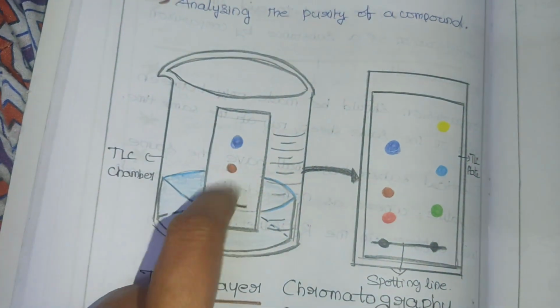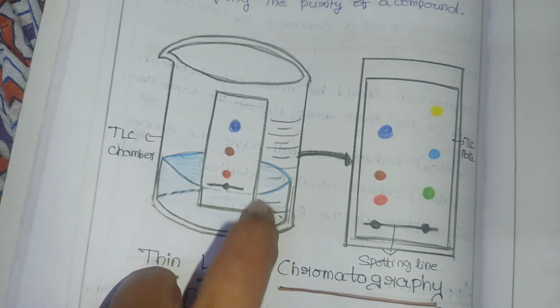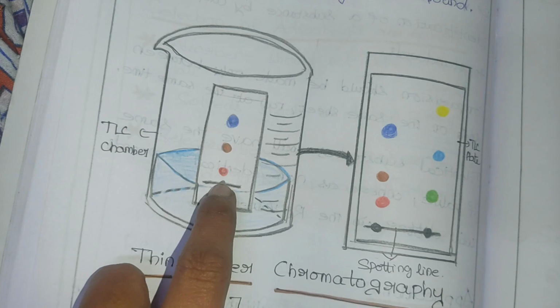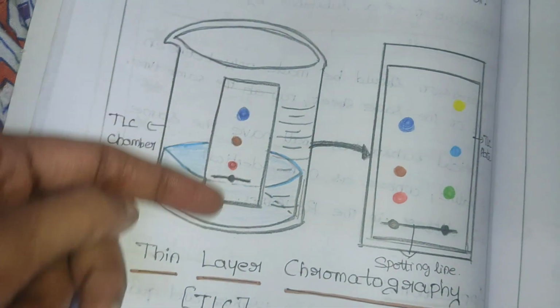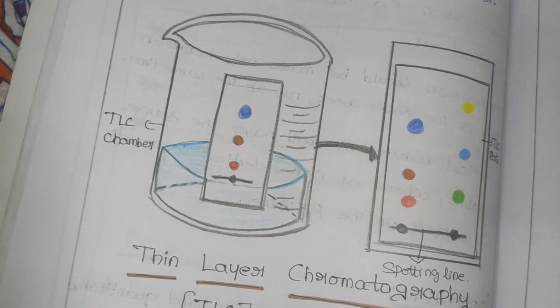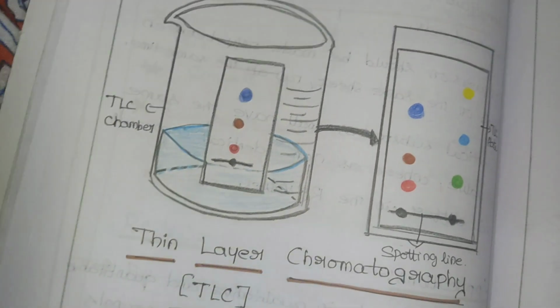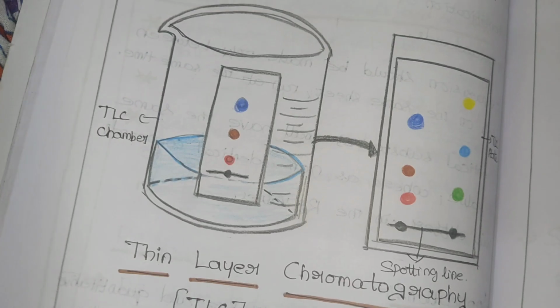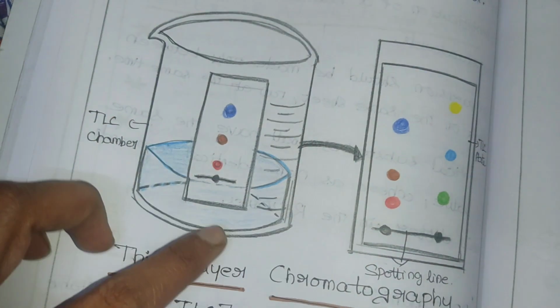So this is the chamber used in thin layer chromatography. Here we draw a line at the bottom of the plate and keep a spot, and we dip the plate so that the spot will not dip in the liquid. Because of its absorbing nature and the capillary forces, the plate will absorb the liquid or mobile phase.